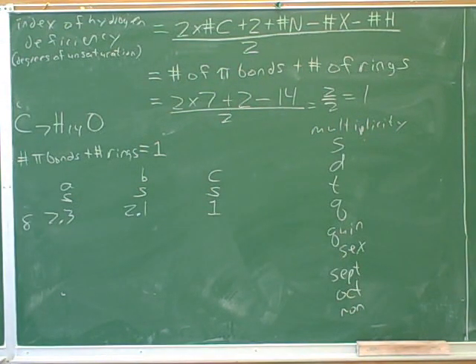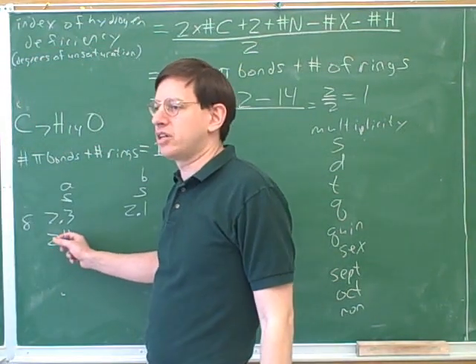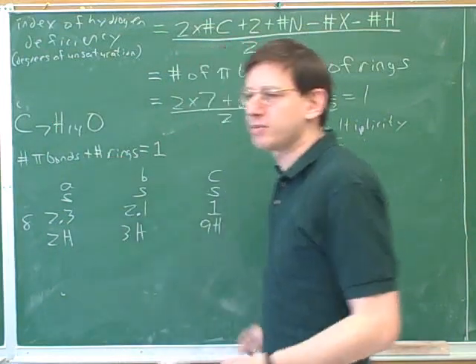So I think I've gotten about all the information that I can. Good. Now, notice in this case, it was easier. They didn't give us the areas. They directly told us the number of hydrogens. If they give the integration with the letter H, then you can assume that's the right number of hydrogens. What's happened here is the computer has done the work on its own. It's already taken the ratio of the areas, and since the computer was told the molecular formula, it can use the ratios to find the exact right number of hydrogens. So 2, 3, and 9. Of course, it's easy to check that. We just have to make sure these add up to 14. But they do add up to 14.